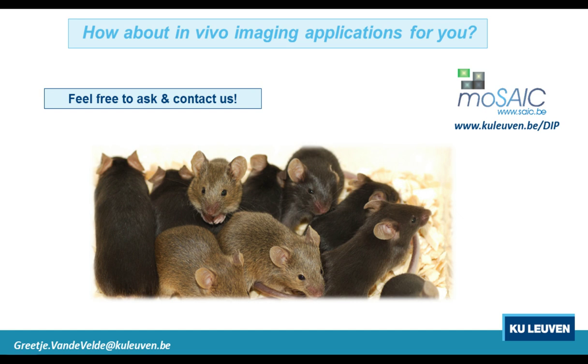So regarding image acquisition, there you need to know a bit about the nuts and bolts, because you can have a super good machine, but an image is only as good as the person knowing about the parameters and the person using the machine. But once you have your image acquired, you also want to quantify and do things. And when you look in literature, you will see that people have custom written algorithms and things that you think, okay, I have no easy access to it, I'm not a software engineer, how do I do that?